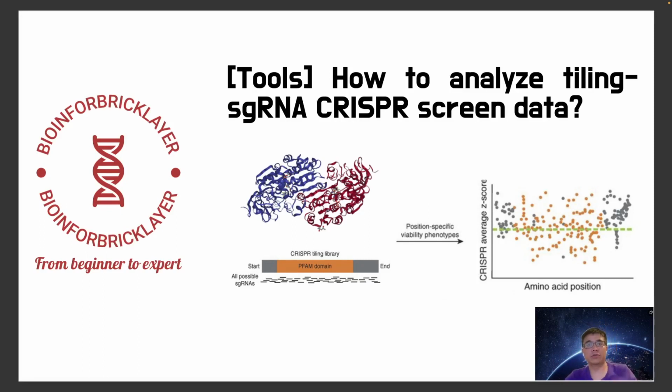Today I'm going to introduce another bioinformatics tool for the analysis of tiling-sgRNA CRISPR screen data. This tool is developed by me, and you can treat this video as an advertisement of my own computational tools.